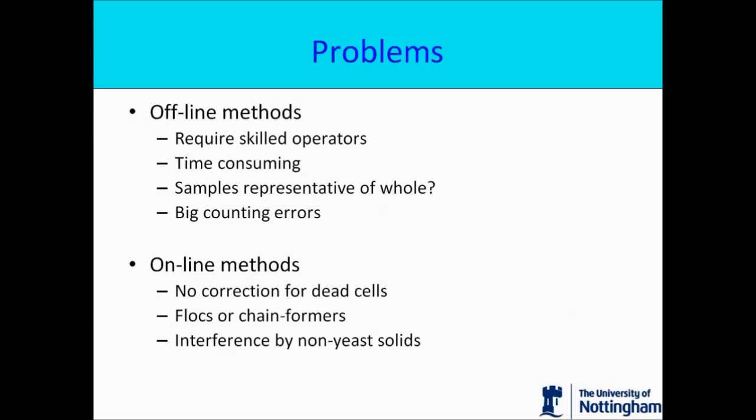When you carry out visual counts, it always involves a very large error. So those methods are generally not very good.